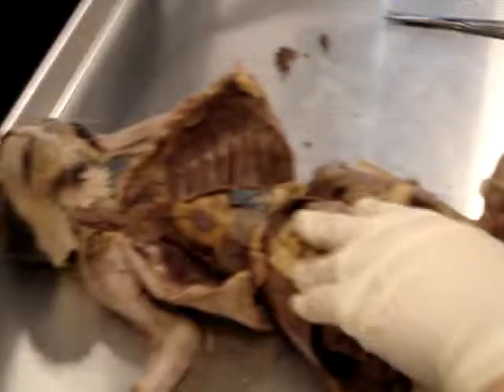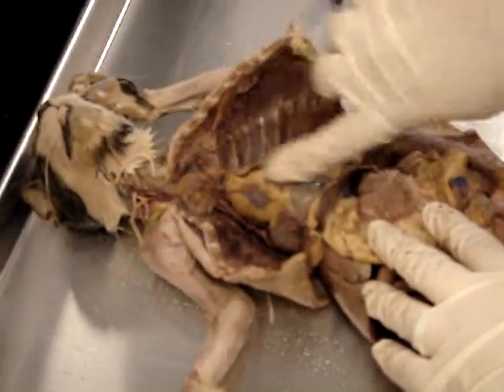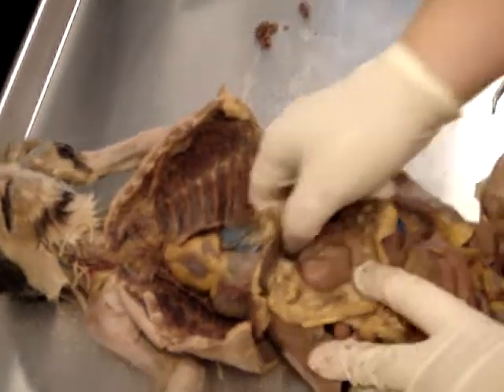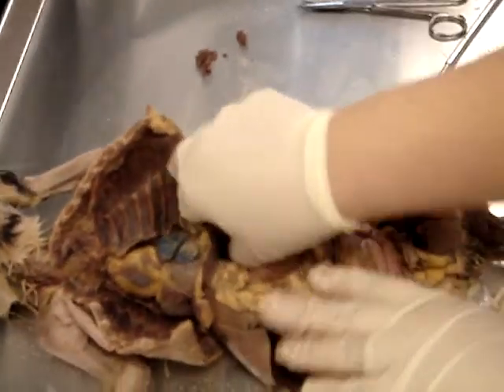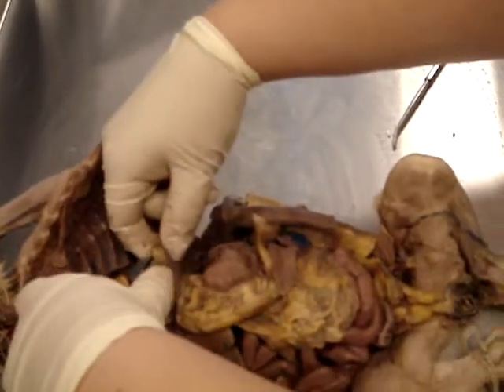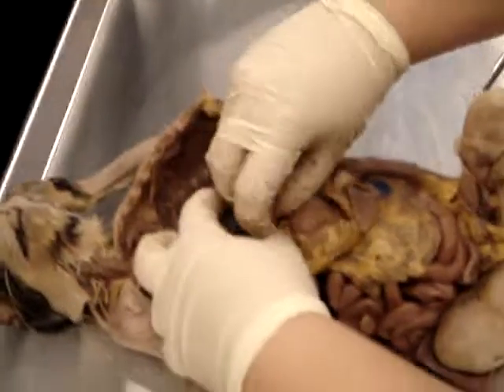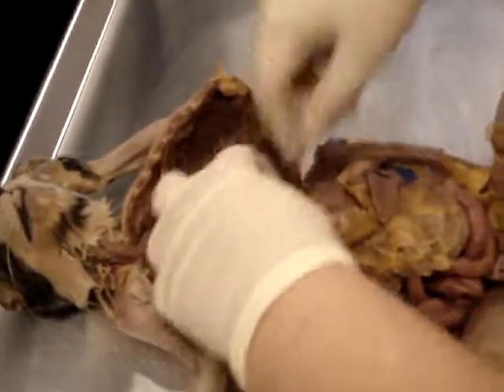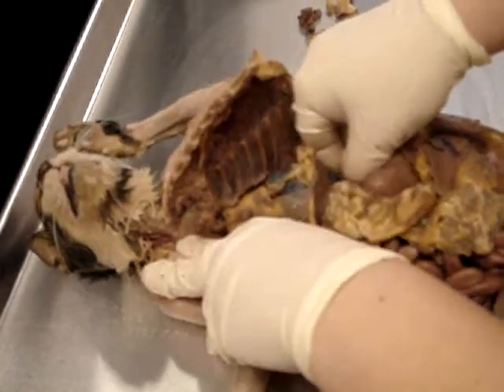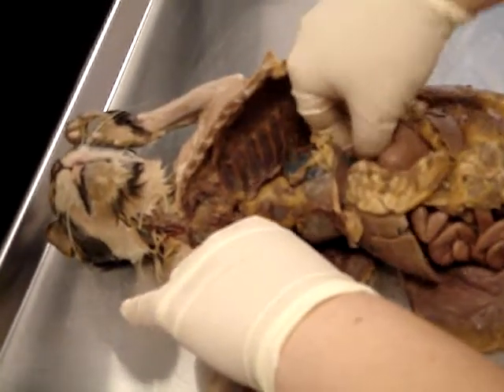Okay. All right. So now the esophagus. So here's our stomach. The esophagus goes all the way up to the pharynx up there. We're going to deal with that in a minute, but for right now, when you feel your stomach, you can stick your fingers in there, and you can feel your stomach passes through a hole in the diaphragm. So here's our diaphragm, right? And there's a hole in the diaphragm. There's some delicious fat here in the way, okay? But there's a hole in the diaphragm where you can feel the esophagus. And I can kind of pull on it. And you see how things are moving up there? Yeah. Because I'm pulling on the esophagus, okay?